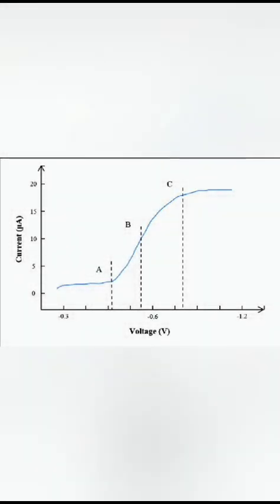Polarography is also known as voltammetric technique. Here, the graph of current against voltage shows what is in the solution and how much of it is present. In it, a chemical species like ions or molecules undergoes oxidation, losing electrons. If they undergo reduction, they gain electrons at the surface of a dropping mercury electrode, which means DME. At an applied potential, polarography is only applied to the DME.